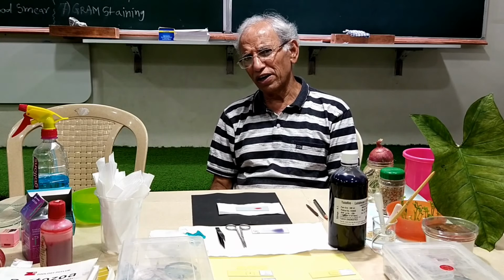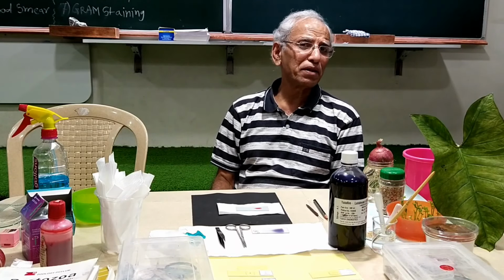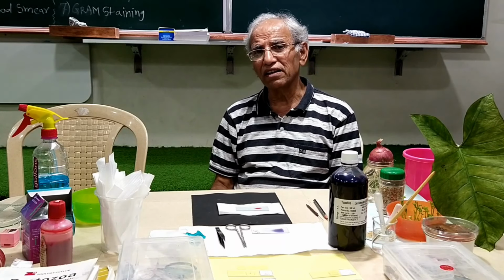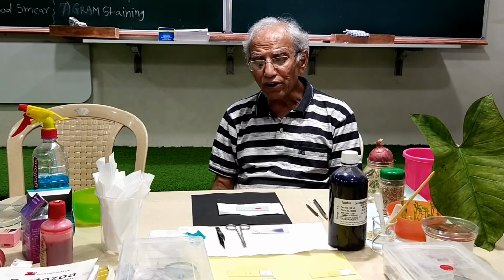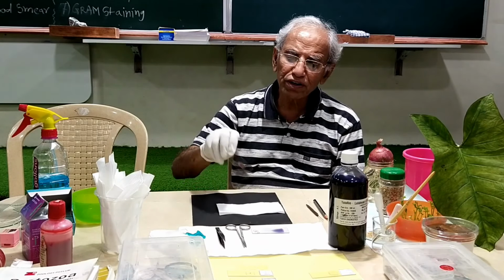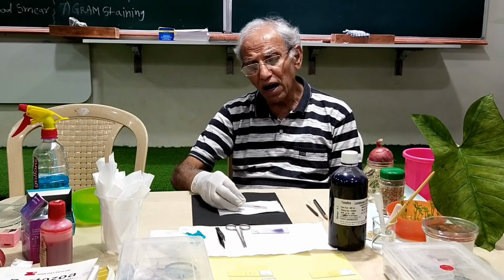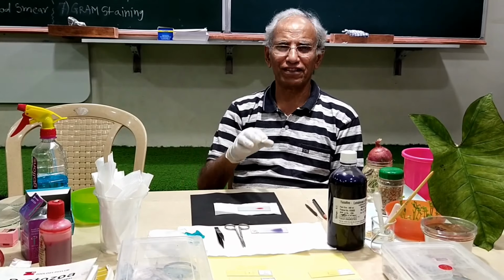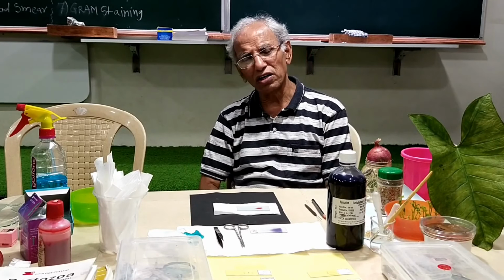I think you have already observed a few minutes back the epithelial cells. A very nice slide could come up, the skin cells, and this is what we are going to observe now. I'm just allowing this to get air dried. It can be air dried automatically. Then after this, I'm going to go for what are called raphides. But about that I'll talk a little later.